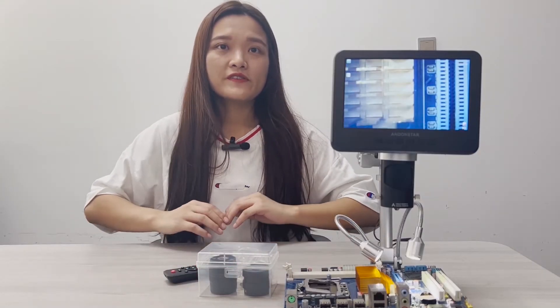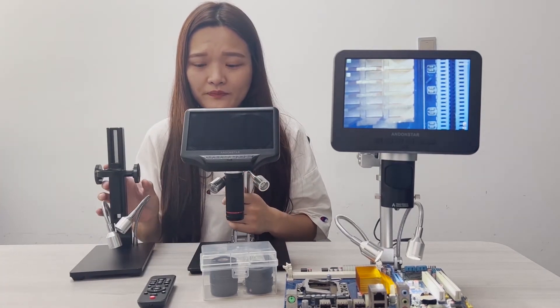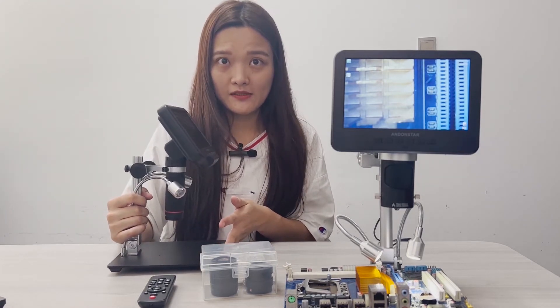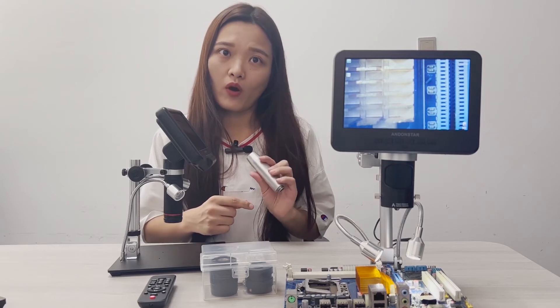The last part of this demonstration is about the new bracket. First of all, welcome to our old friends AD407 and ADSM302. Even though these two are still popular models, we did get complaints about the bracket. The X stand is the most common type you could find in the market. No matter how popular it is, the fact you have to admit is it's a little small, and that's why we and all other sellers start to sell it with an extension tube. If you need an extra extension tube to raise the bracket height, check the link down below — we have listed all industrial models this tube can work with.